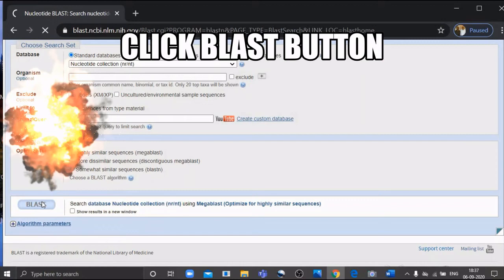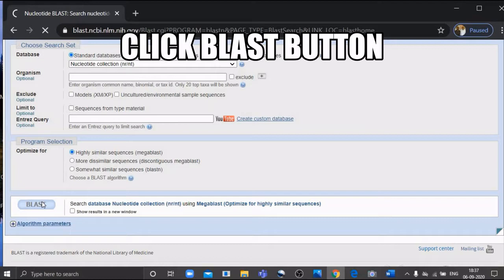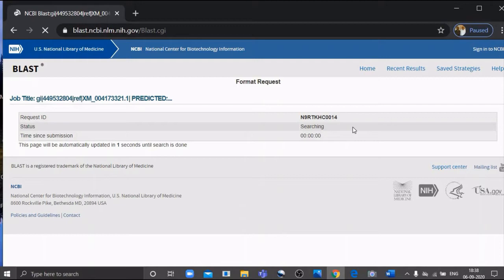After pasting your sequence in the search region, you click the BLAST button. It will take only a few seconds to get the results. You receive a job title and a request ID, and then your results are displayed on screen.